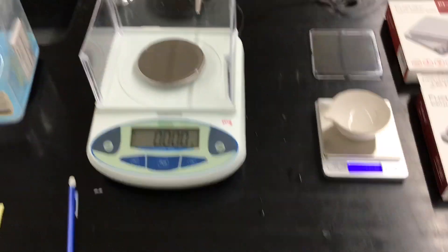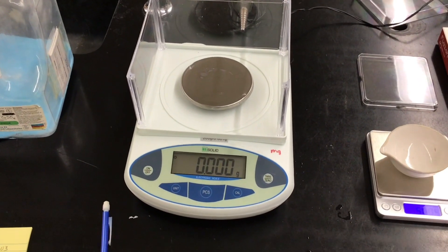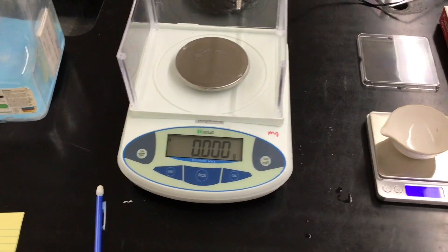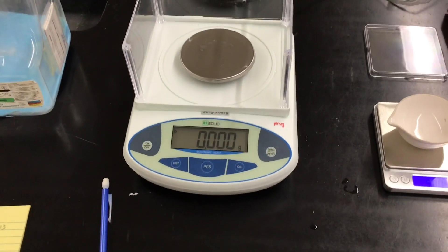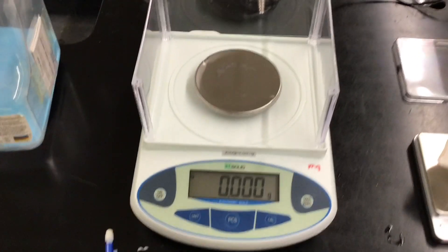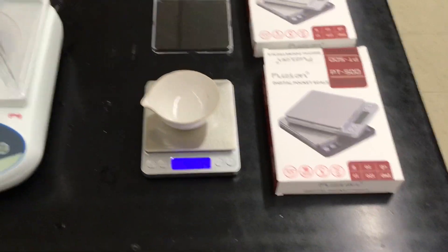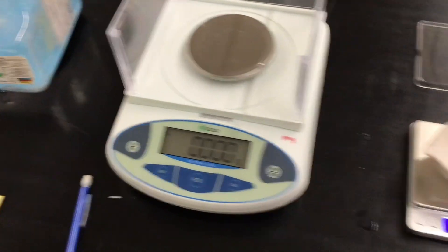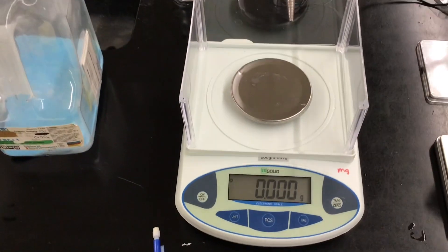I'm going to have a control group using our good balances — when I say good, I mean the old balances. I have some old Flinn Scientific balances we can't buy anymore because they're too expensive. This milligram one was about $100 from Amazon. If I can buy seven of these $15 scales per one of those, and the results are pretty good, that's a win.